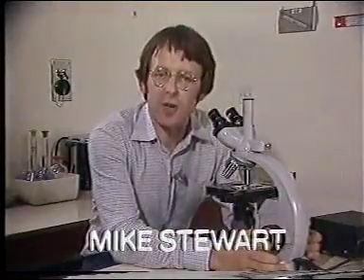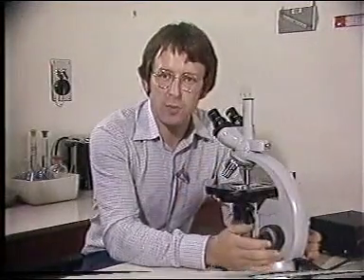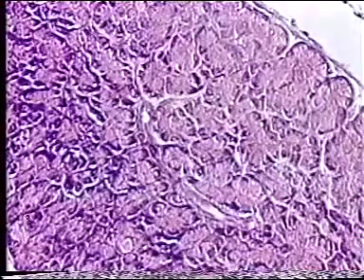I'm looking at a section of rat pancreas at a magnification of about ×400. I want to find out all I can about the structure of the pancreas and about its function. This slide has been prepared by chemically fixing a piece of pancreas which has been embedded in paraffin wax. A thin section has been cut, which has then been stained with hematoxylin and eosin.